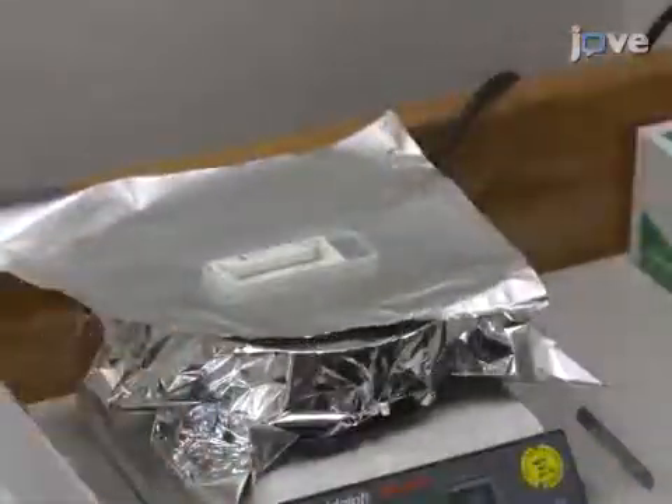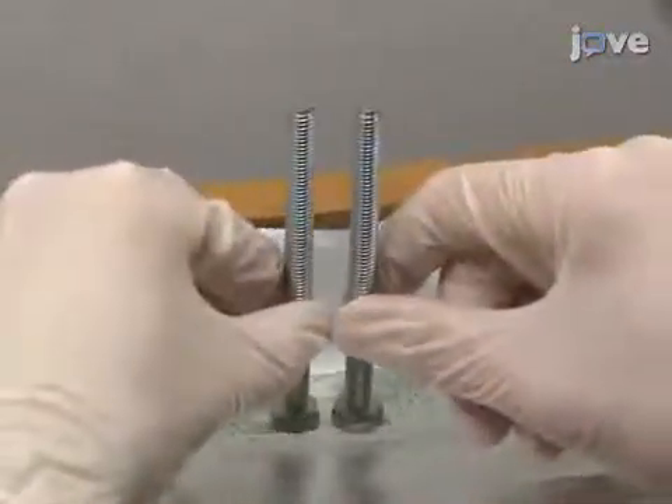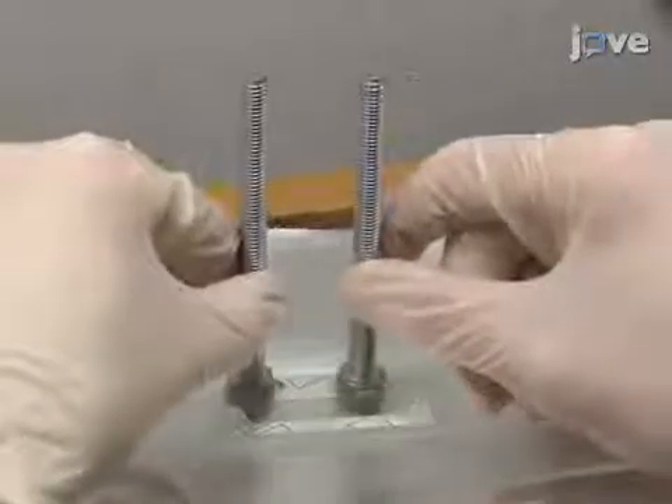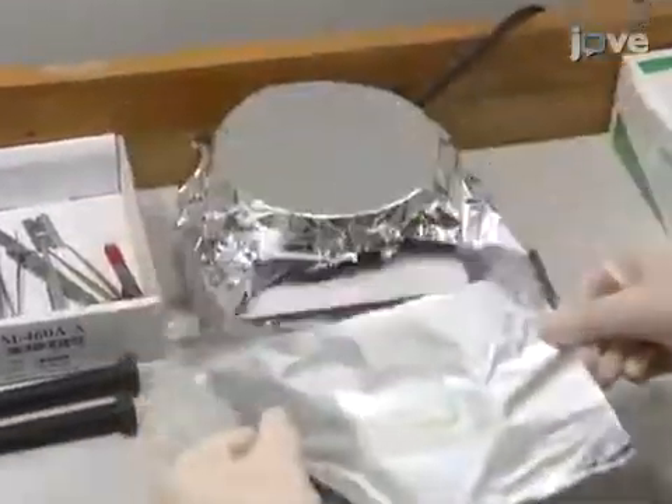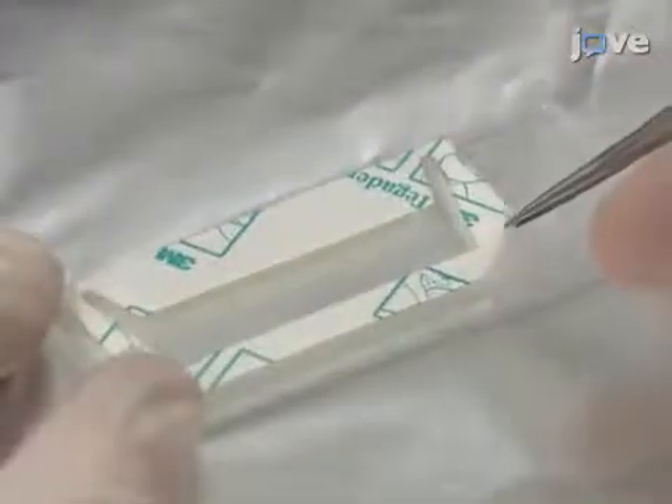Heat the slide to 80 degrees Celsius on a hot plate for one minute. Press the film onto the slide for 30 seconds using an extra microscope slide to distribute the pressure evenly, and then allow the assembly to cool for one minute. Peel off the protective sheet covering the adhesive.